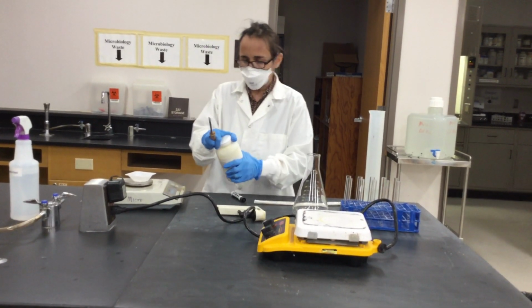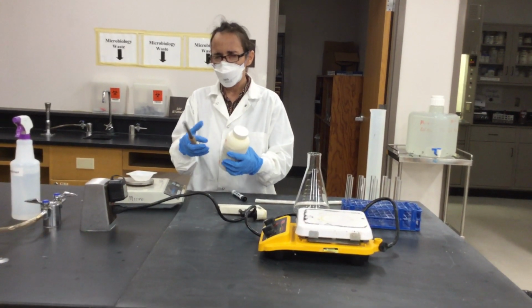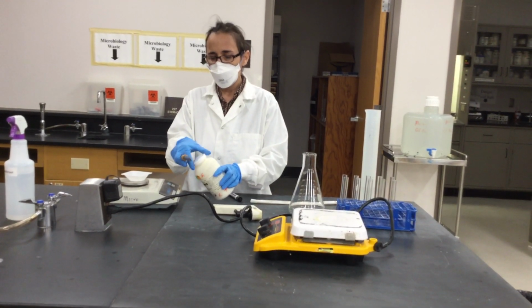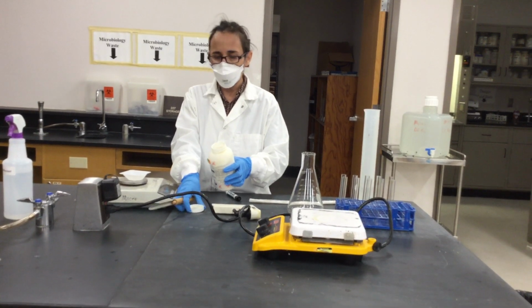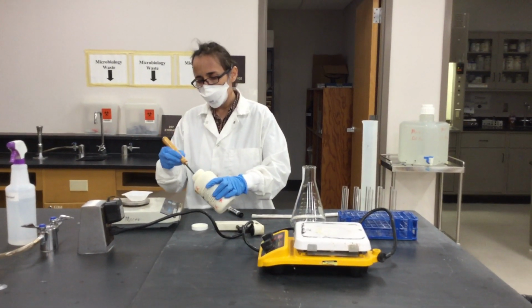So whenever you open these containers, especially tryptic soy agar, the powder is very fine, so try to not basically inhale a lot. And when you are grabbing it, be very careful.